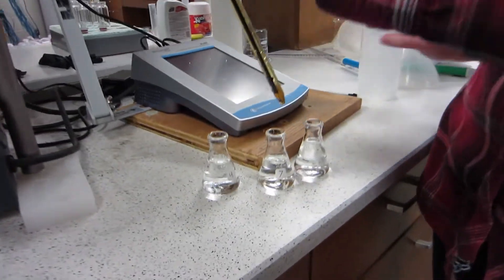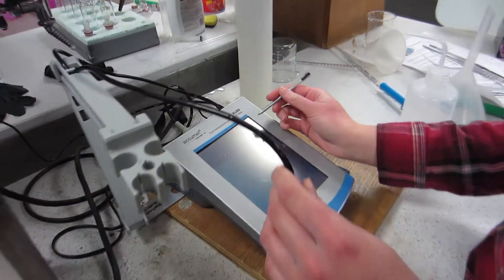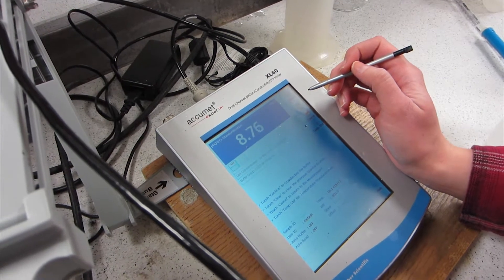Next, we're going to go to the 7 pH, and then the 10 pH. You're going to go through the same procedure that you did before. Hit standardize, wait until it blinks at you, and then insert the pH.